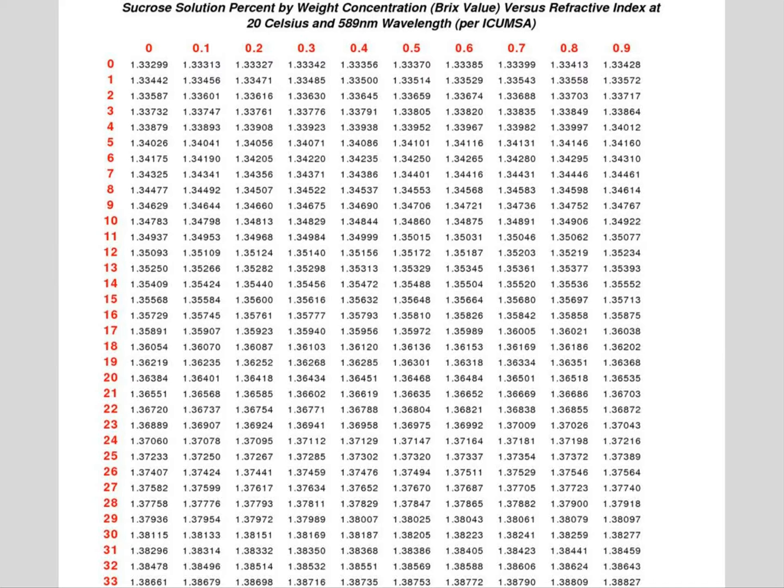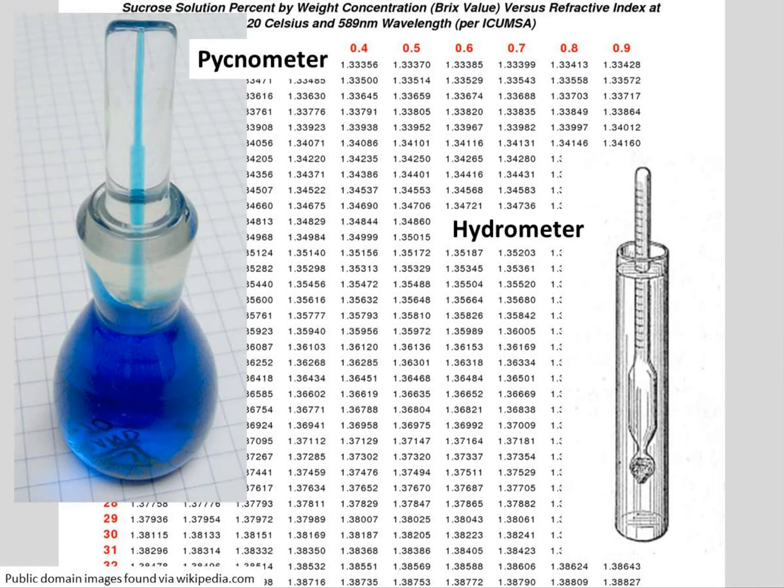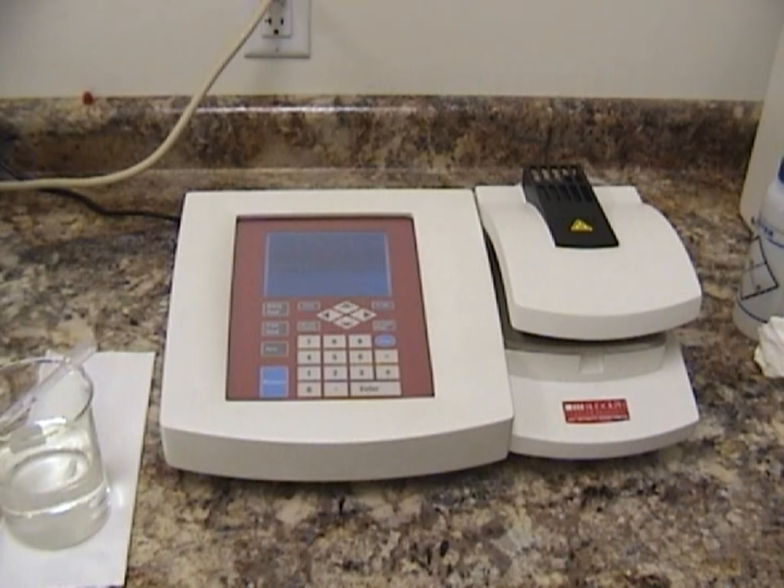Traditionally, specific gravity is used and is measured using either hydrometer or pycnometer. These are less than ideal in many applications. More recently, these are often replaced with a vibrating U-tube density meter, but these too have some shortcomings. Given that there is a known relationship between the sugar content and the refractive index, and that the refractive index of sugar solution is quick and easy to measure, the refractometer has the edge over standard practices.